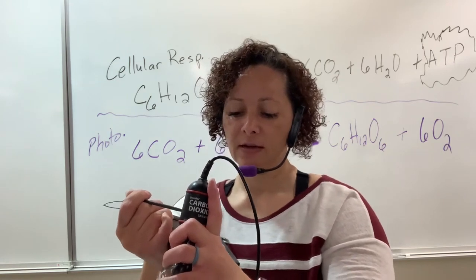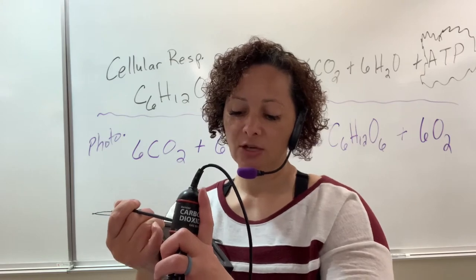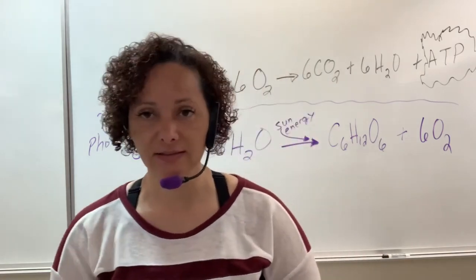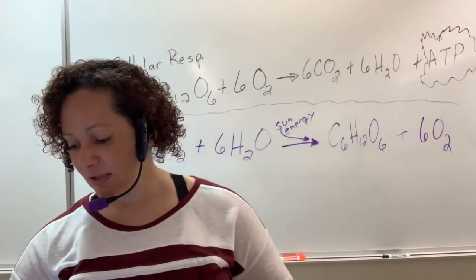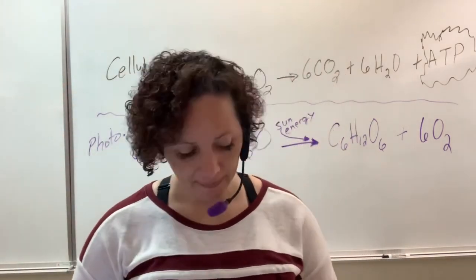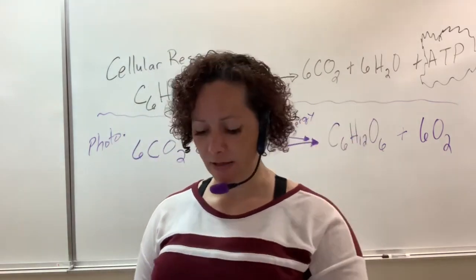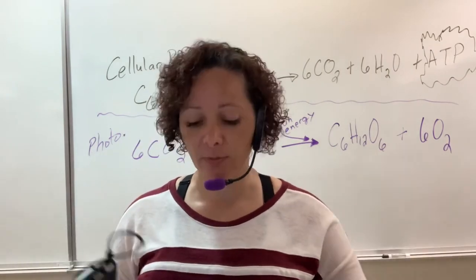Perfect. Now I'm looking at my parts per million on mine, and you're trying to get about 380, okay? It's going to toggle. It's not going to stay at 380 all the time. I'm just letting you know that. If it toggles somewhere around 400, 420, or 320, something like that, you're good, okay? So with that, this is nice and calibrated. Don't unplug it. The moment you unplug it, you're going to have to recalibrate it.